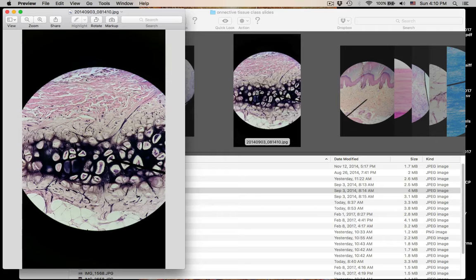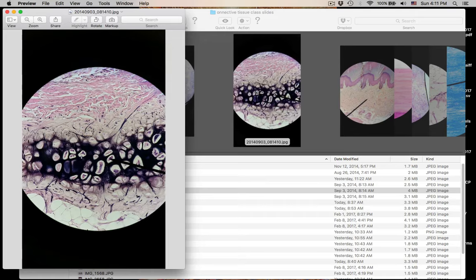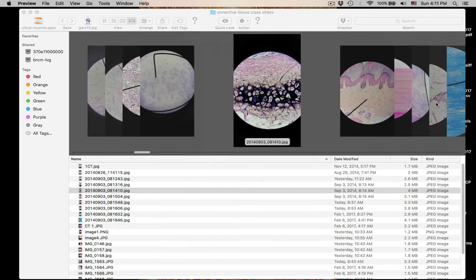This is elastic cartilage — still has lacunae and chondrocytes. But look at the matrix filled with the dark-staining elastic fibers. So this is elastic cartilage. You can also see some adipose tissue down here. That was number five: elastic cartilage.